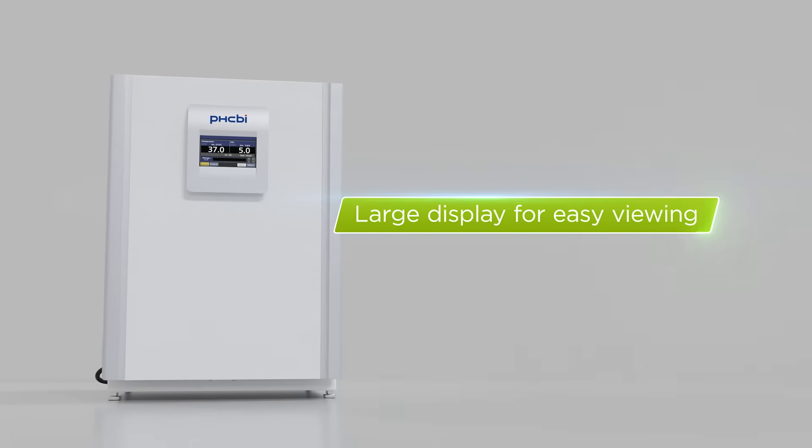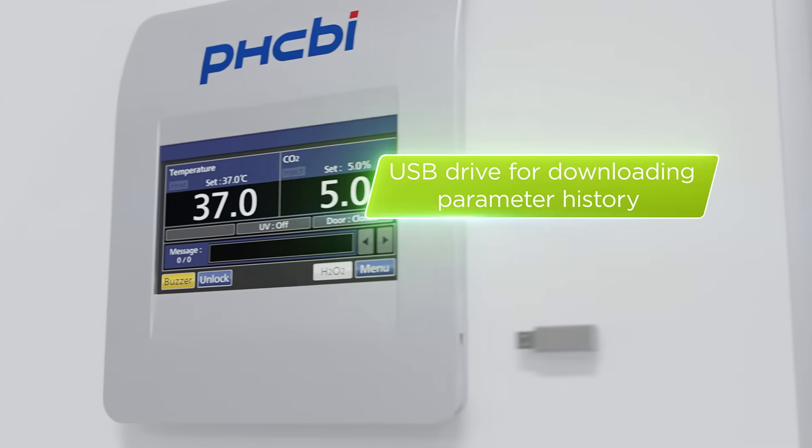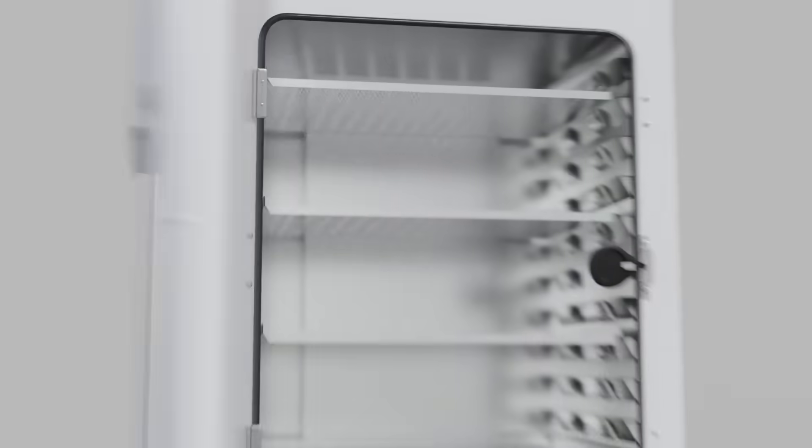The large display allows for easy viewing from anywhere in the lab, and it includes a USB drive that enables you to easily download parameter and door opening history.